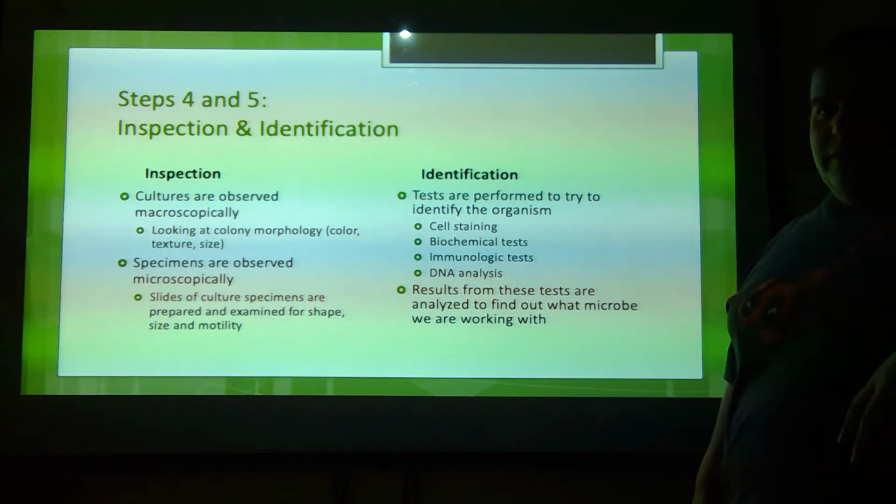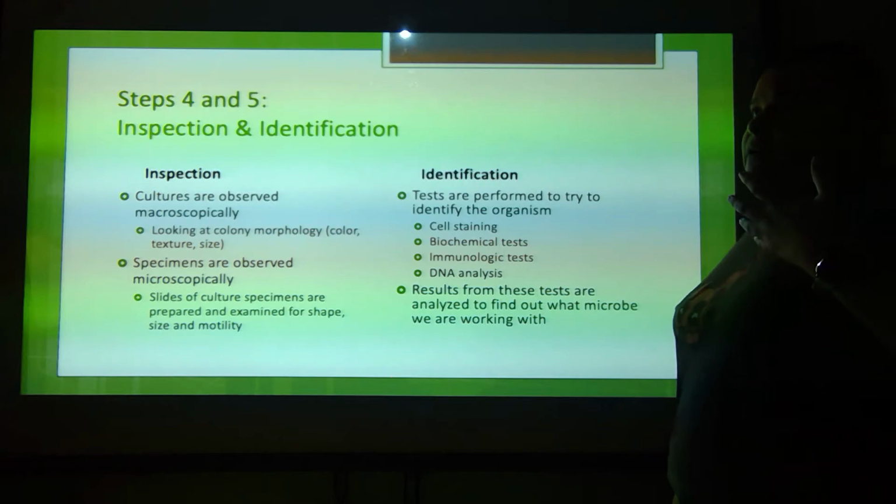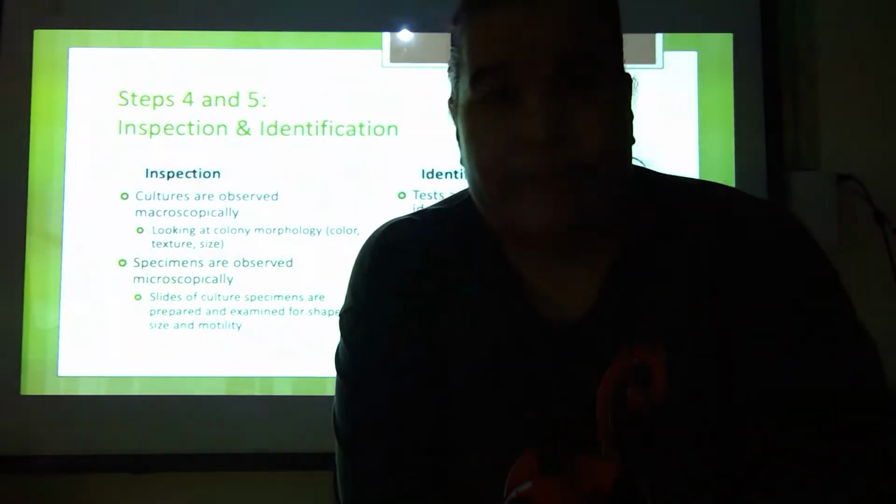Biochemical tests. Does it have catalase? Well, if I put hydrogen peroxide on it and it doesn't have the enzyme, there will be no bubbles.